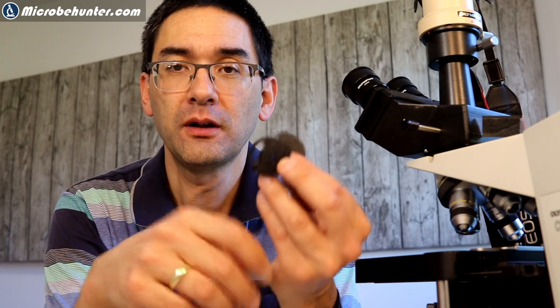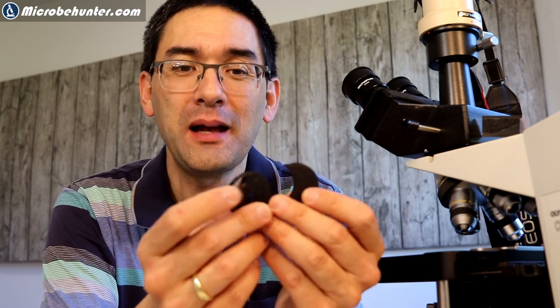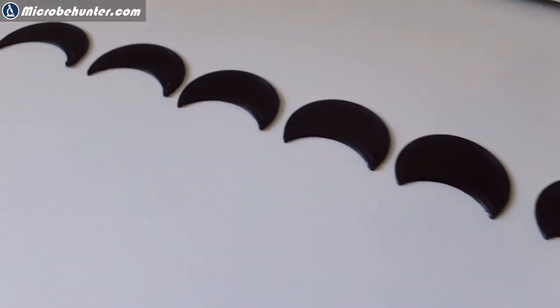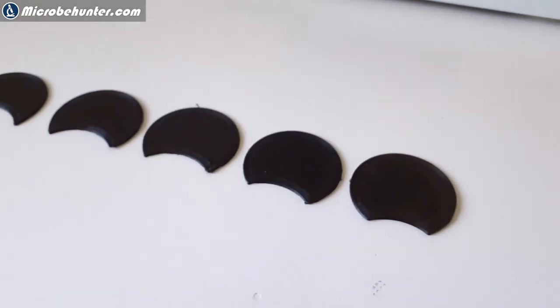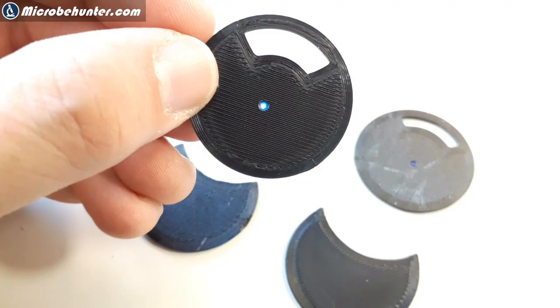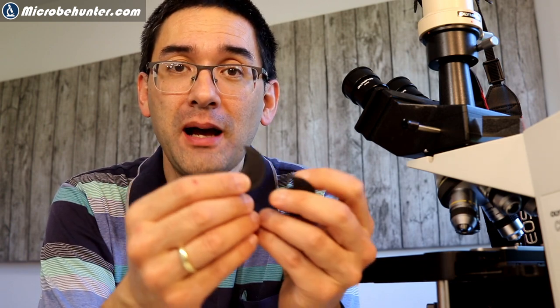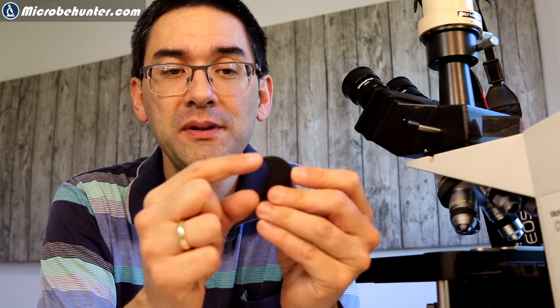I've been experimenting with various sizes, shapes, and different cutouts. People over the years — I'd almost say over the past century — have tried all sorts of different shapes. I made a whole set of filters with different sized cutouts and experimented around. Sometimes I even drilled a very small hole in the middle, but that didn't work very well. The way it works is that light striking the object from the side and light going directly through the object interfere with each other and cause those shadows to appear.